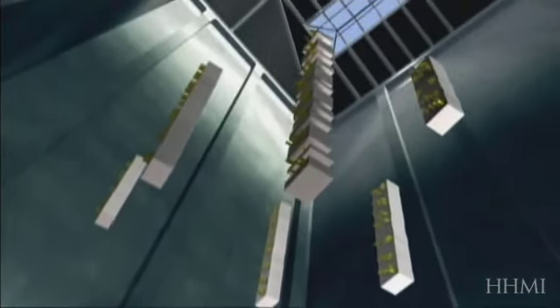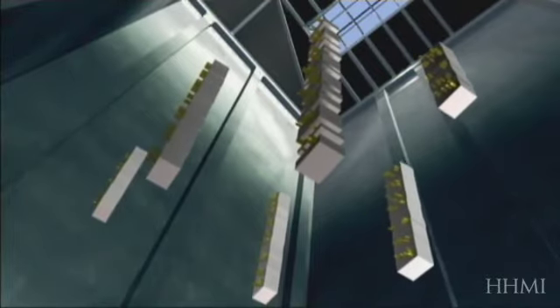Once enough sequences were tagged, various blocks of the genome were allocated to different academic centers for sequencing. To begin the sequencing process, several copies of a section of DNA, represented here as a page of text, are cleaved to produce smaller fragments.